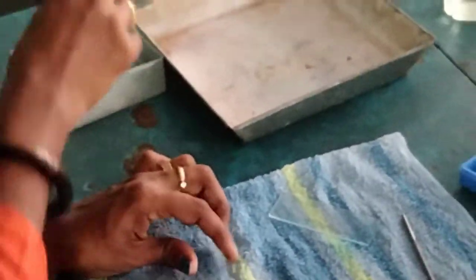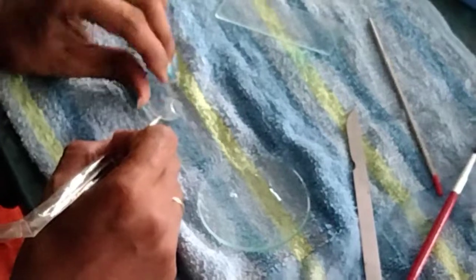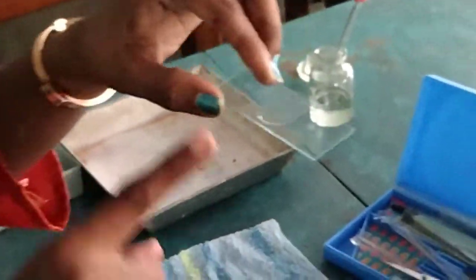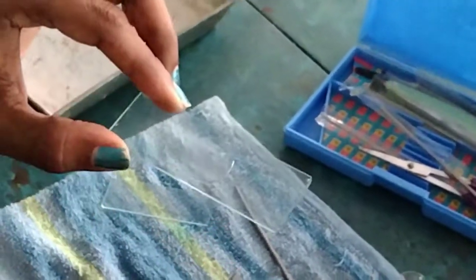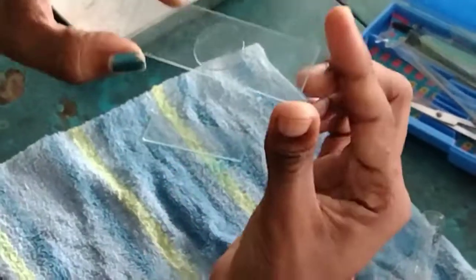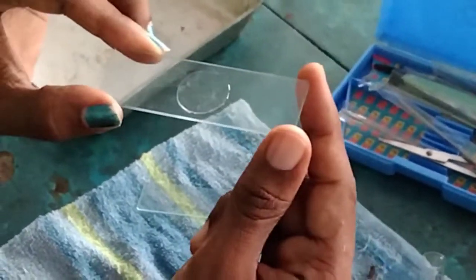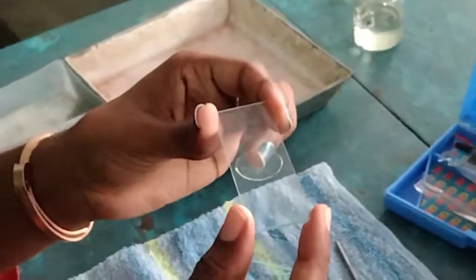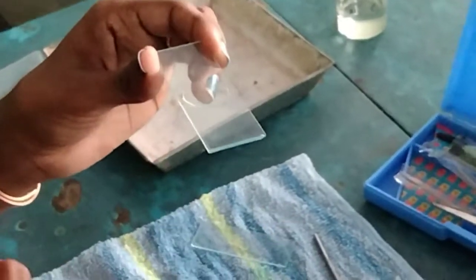Now you can add a drop of glycerin, and then place the cover slip. The slide should be neat like this — there should not be any extra water or glycerin, and the glycerin should completely fill the cover slip. There are marks for neatness of the slide, so the slide should look like this. Now you can view this slide under the microscope in low power. You will be able to see the scale like this.